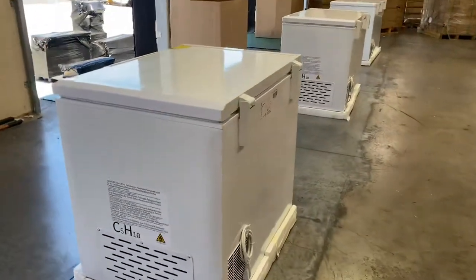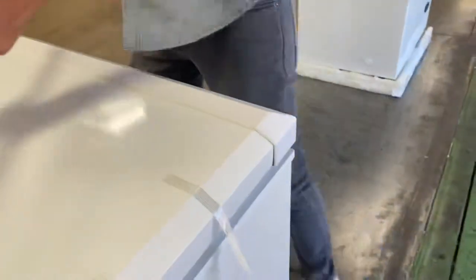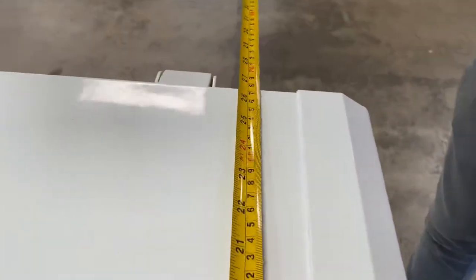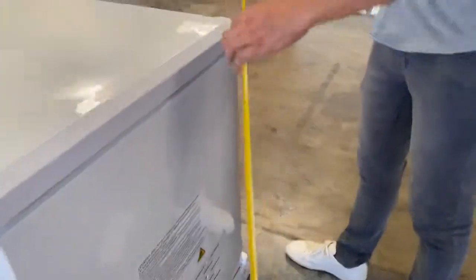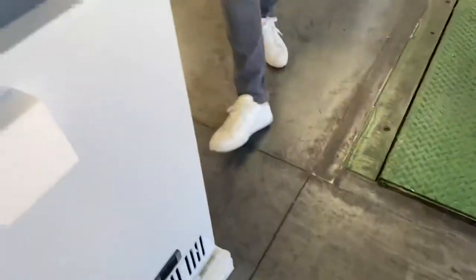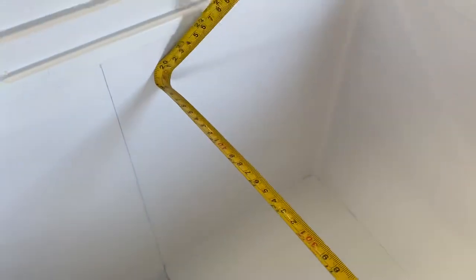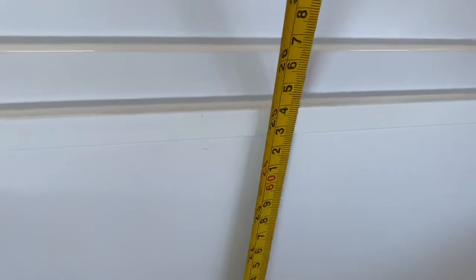On to our second model over here. You're looking at a length of 36 inches by 28 of the depth. The overall height, you're looking at 35. Casters are included. We're going to go ahead and open up this unit — same thing, a basket is going to be included as well. Interior length, you're looking at 29; depth, you're looking at 20; and the height is 25.